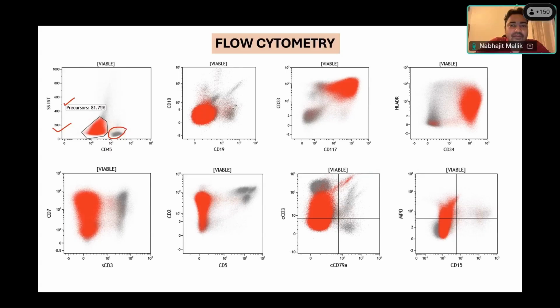This is some CD19 positive, maybe normal B cells. This is some CD10 positive, maybe granulocytes. So these are CD19 and CD10 dual negative. So probably not B lineage cells. What about CD33 and CD117? Both are positive, sir. Good. So this is what kind of lineage? CD33 and CD117 is which lineage? Myeloid. Myeloid lineage.